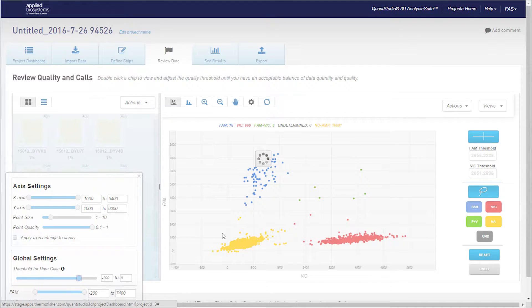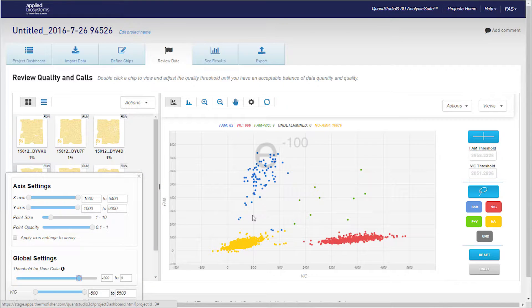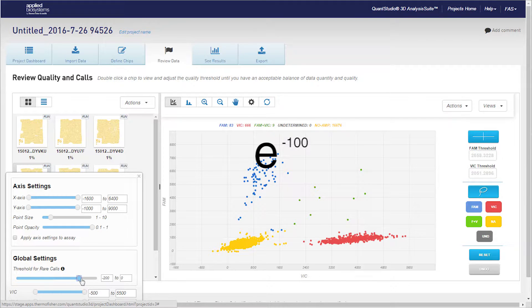For example, if a value of minus 100 is selected on the bar, this corresponds to a value of E to the minus 100.